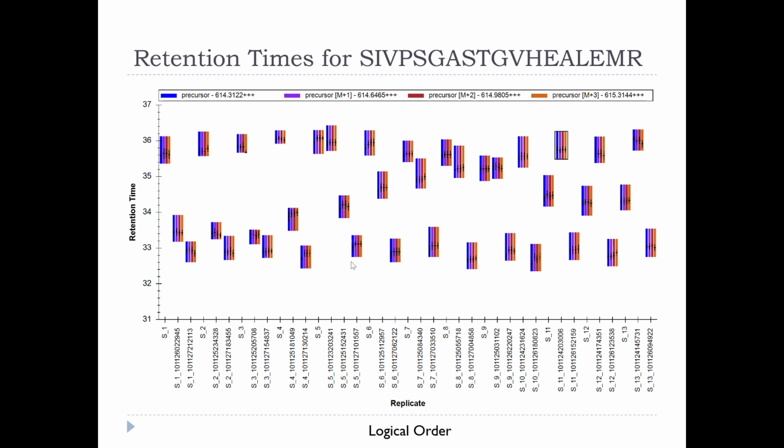Because yeah, it's true. Let's just say, in the perfect world, what do I expect? Yeah, just a straight line. It's always a good idea to ask, what am I expecting? And then what am I really seeing? Even in a not perfect world, maybe I expect to see some variation, but I don't expect it to be jumping around all over the place like that. That's crazy. That's a lot of variance. I went, whoa, I'm not sure I've seen any retention time variance like that.